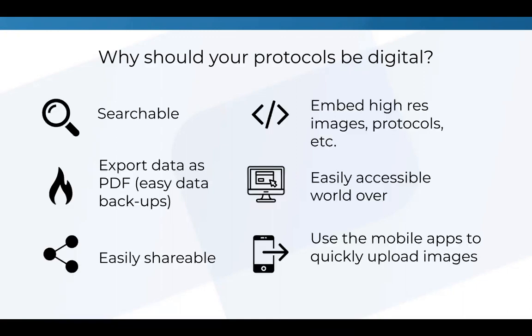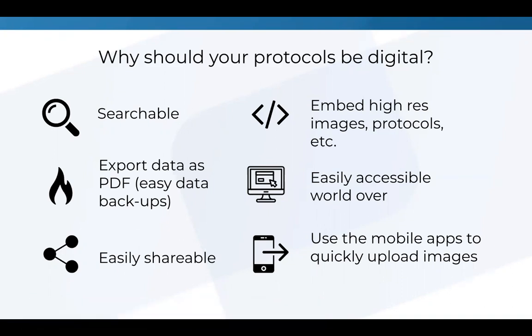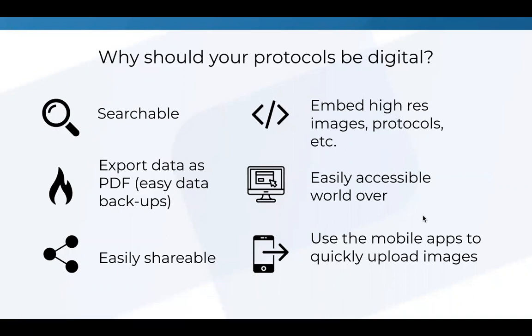It's a good one. I have a couple of reasons here, but there's actually an endless list of reasons. One is, yeah, it's searchable. It's easy to copy and paste, as you mentioned, and they will be available for longer. It's also much easier to back up data, because it's very important to always back up your things. You can export the data as PDFs and back it up in multiple places. It's very easy to share protocols. You can embed high resolution images. You can access it from all over the world, and you can also use mobile apps to quickly upload images or other things. So there are a lot of benefits to having your protocols digital.